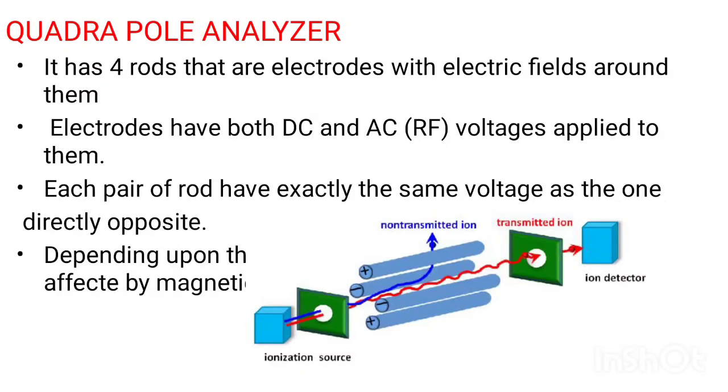Here the DC bias will cause all the charged molecules to accelerate and move away from the center line, the rate being proportional to the charge to mass ratio. If their course goes off too far, they will hit the metal rod or the sides of the container and be absorbed. So the DC bias acts like the magnetic field B of the mass spectrometer and can be tuned to the specific charge to mass ratio hitting the detector.